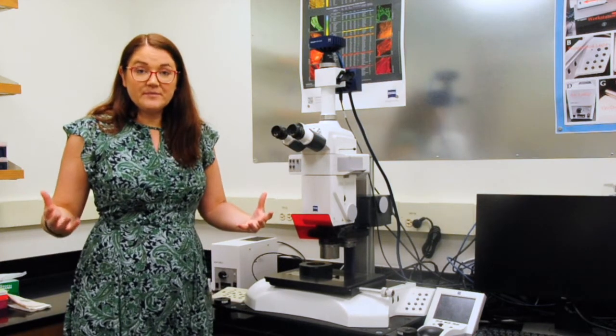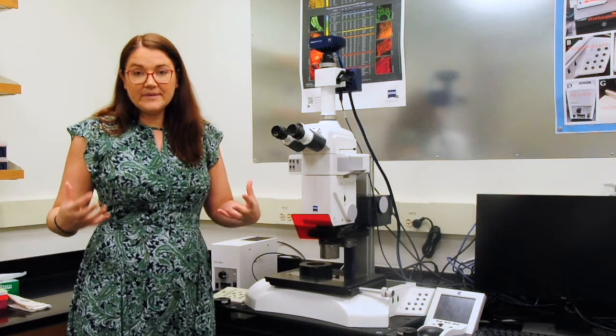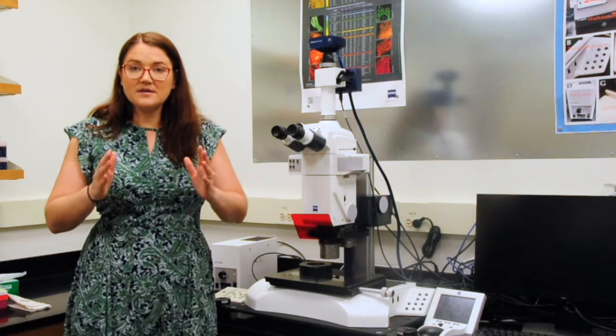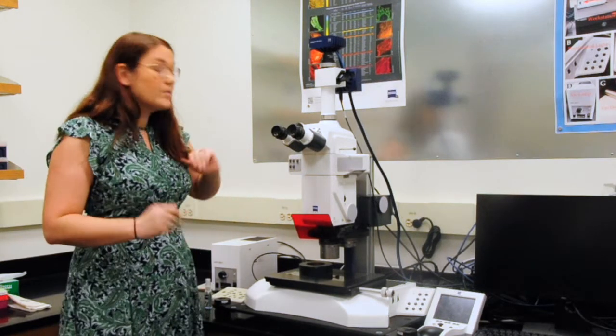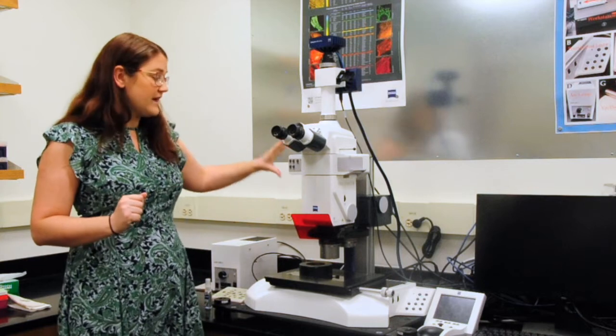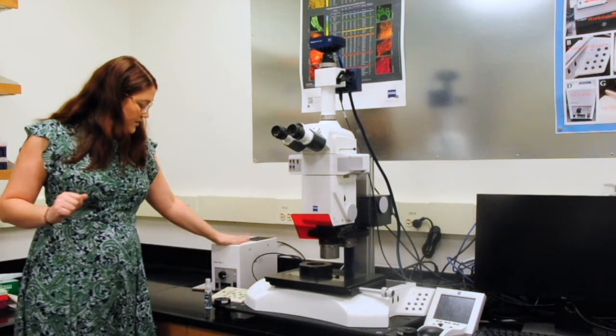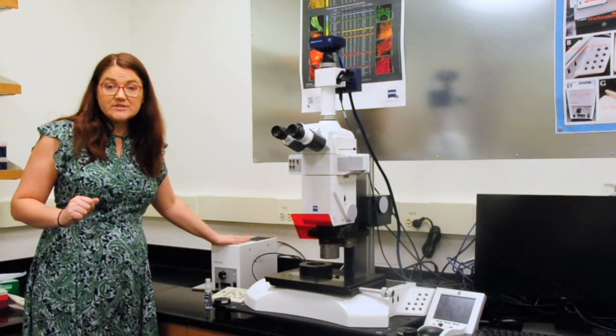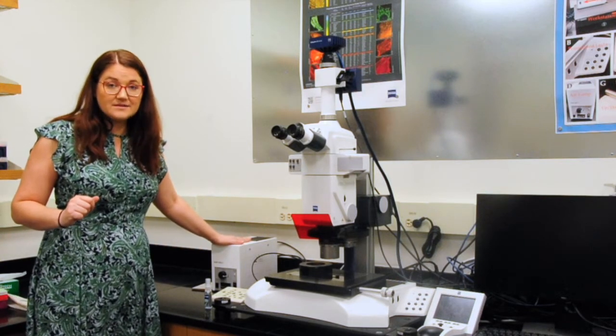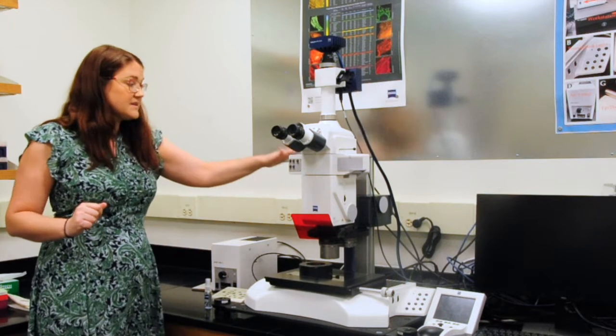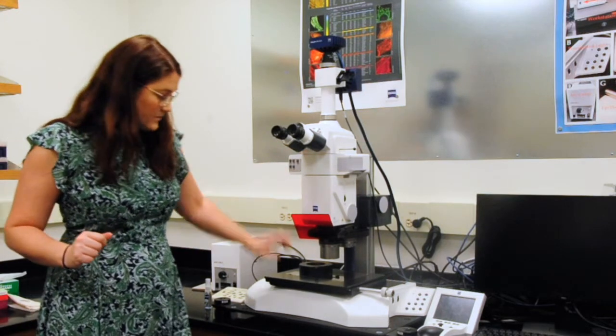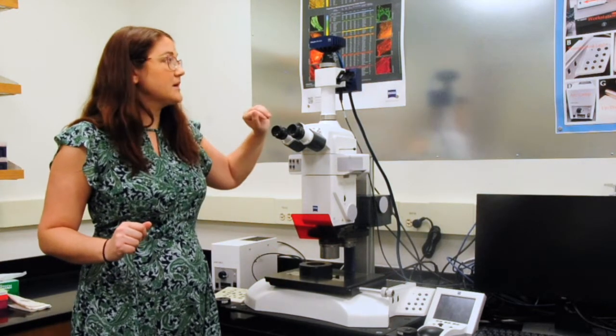Now, what is special about a common main objective microscope versus a Greenough microscope is that because of the formation of the light, we are actually able to put a fluorescent turret in here. And this is powered by our HXP 200. This is a metal halide light source, comes in through here, and we have our filter cubes, and we can bounce it off, come back up, and collect.